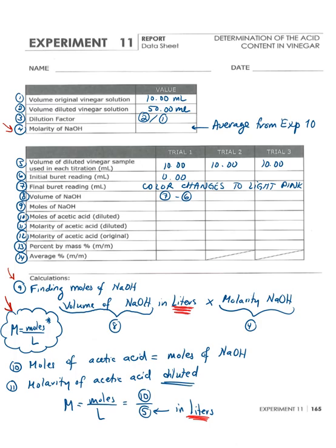Now, the moles of sodium hydroxide is what we need to convert to moles of acetic acid, because to find the concentration of acetic acid, you need to know how many moles of acetic acid you have in your sample. Now, to find out the molarity for your acetic acid, and this is for the diluted sample because you prepared your samples using your diluted solution.